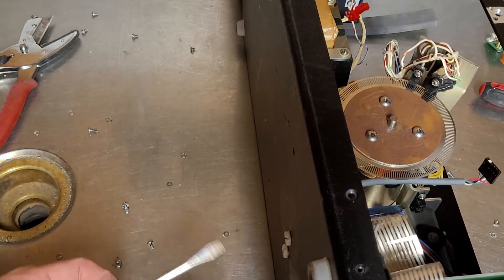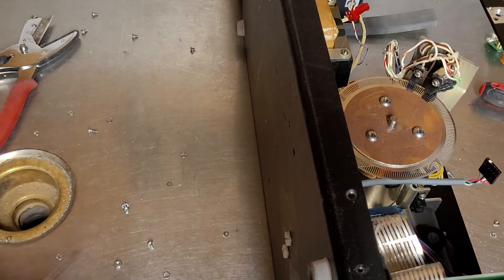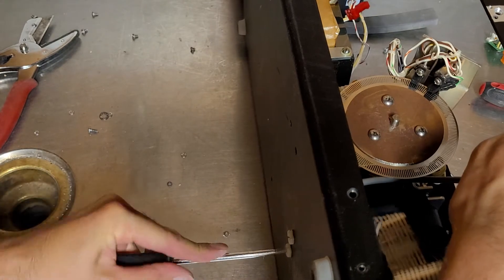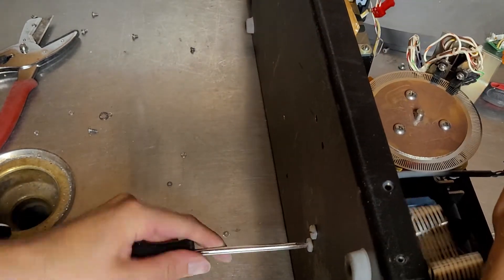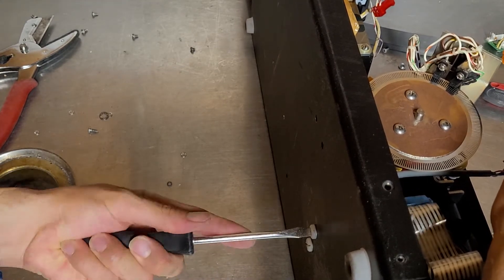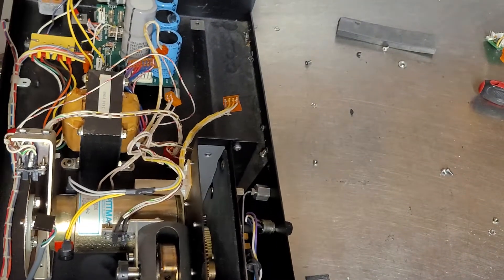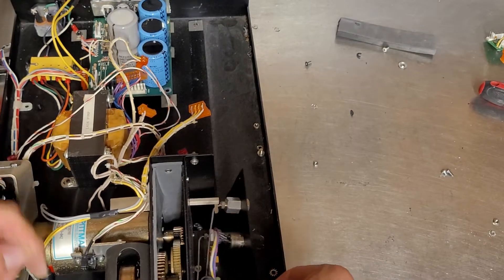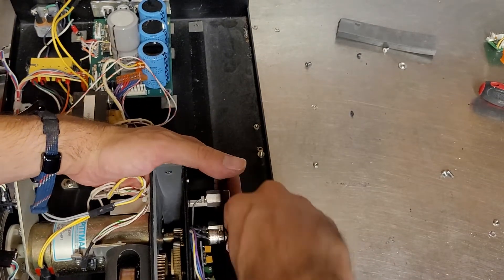I just snapped that one by turning it. It takes a lot of force and I just ruined that one.